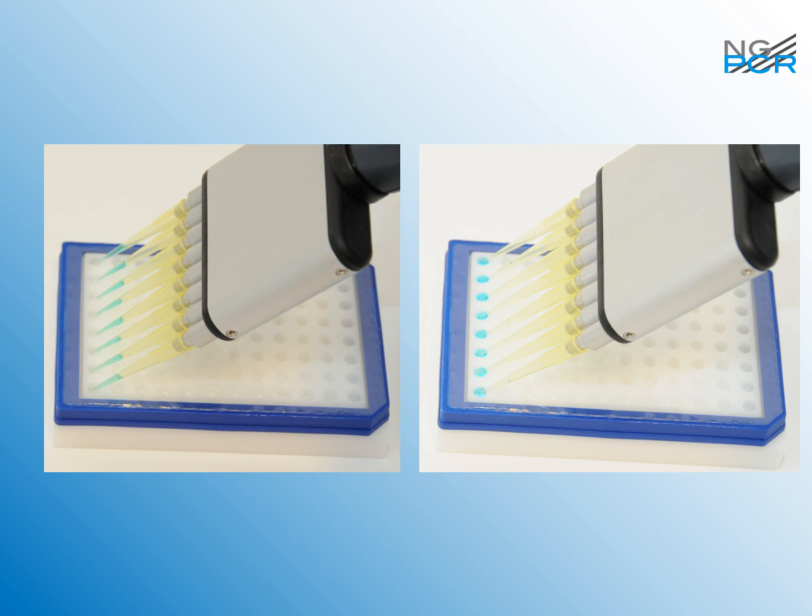spill over and it will contaminate the next well. You would think that, but here physics is helping us. The surface tension of the liquid keeps the liquid together, and the attraction between the polypropylene and the liquid keeps it in the plate. So you can actually take this plate, keep it upside down, and nothing will fall out, nothing will happen. Meaning that you could use it, for example, with the acoustic pipetters that people start to use now. They shoot up a little bit of liquid to a microtiter plate, and a little bit of liquid stays in the microtiter plate, which is upside down above the acoustic pipetter. This plate would also work.